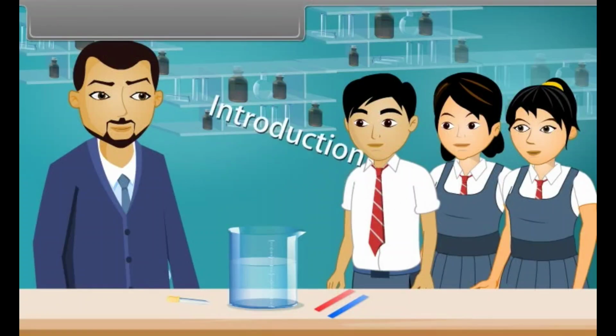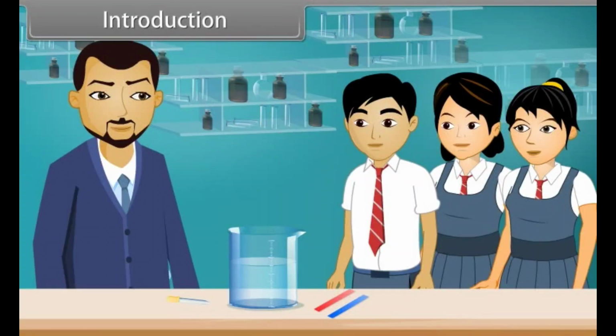Hello students. Good morning, sir. Very good morning. Today we will perform an experiment to identify the acidic, basic or neutral solution.